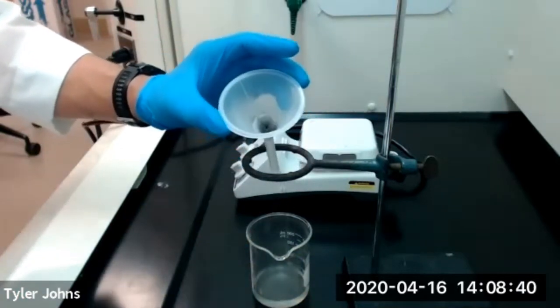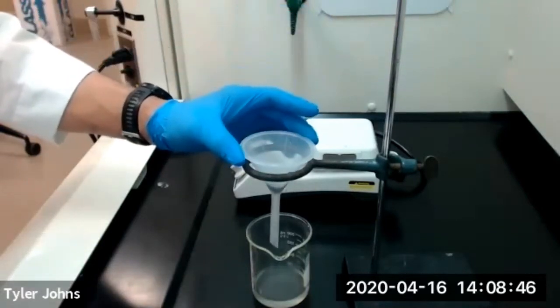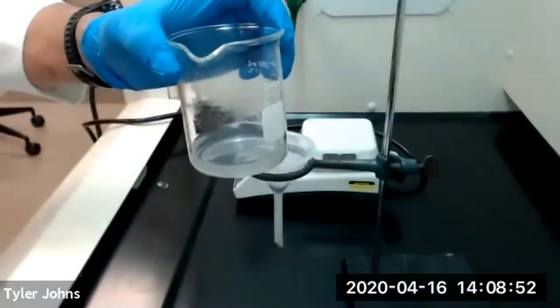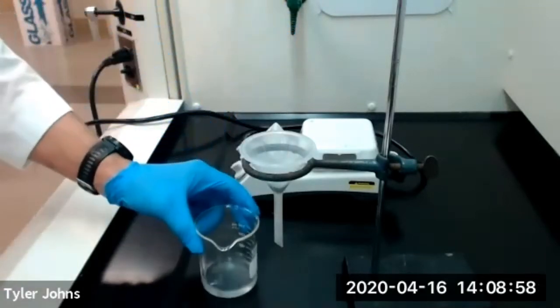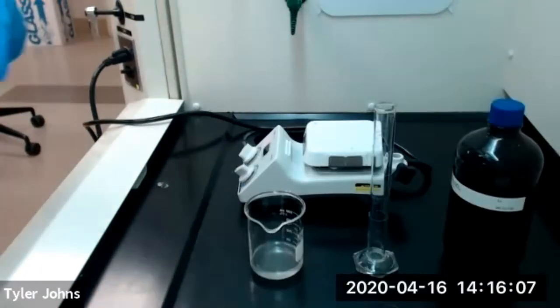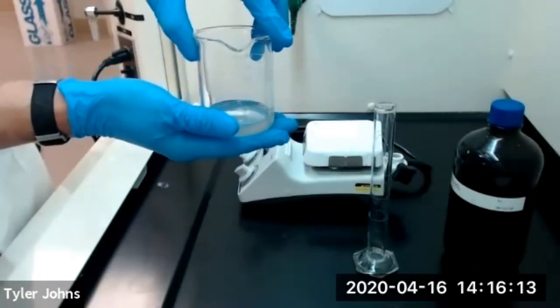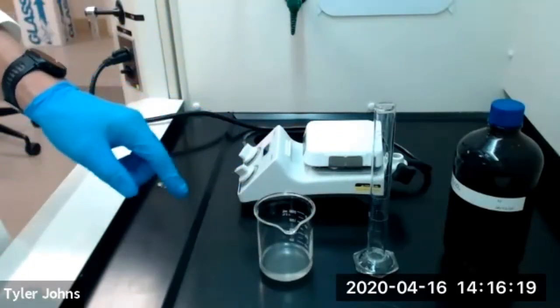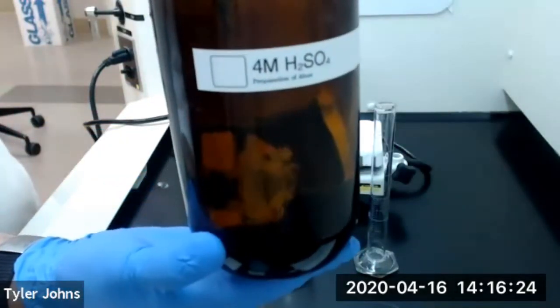You can see we captured a lot of those impurities in our glass wool. Now we're going to take this beaker with the filtered solution and run some tap water on the outside to cool it down. Our solution has cooled down, so now we're going to make the solution acidic with the slow addition of 45 milliliters of 4 molar sulfuric acid.